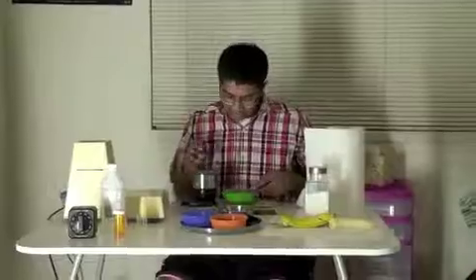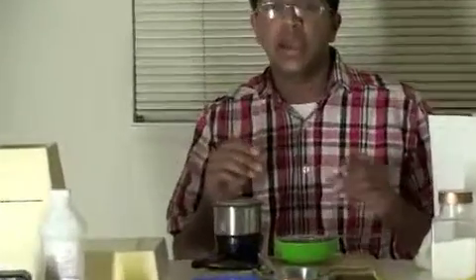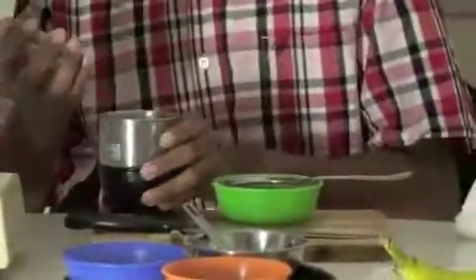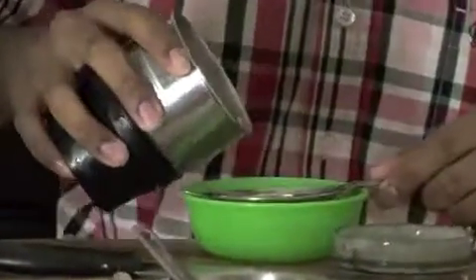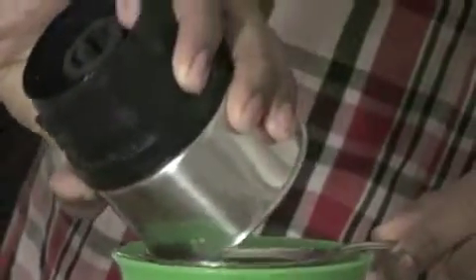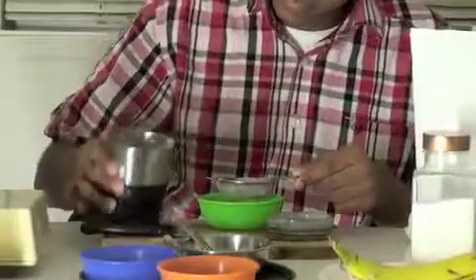Now, for this part, we need to strain out the cell membrane, as Aditya was saying. It's the same concept of isolating where the DNA is. Because when you're doing this, you're taking care of some of the lipids in the cell membrane and pretty much taking out the chunky part of the cell membrane. This is, like Aditya said, some of the more gross parts of this, because you actually have to use your hands to get all the juice out of the banana. And especially because the banana is so chunky, it's going to be a little bit harder.